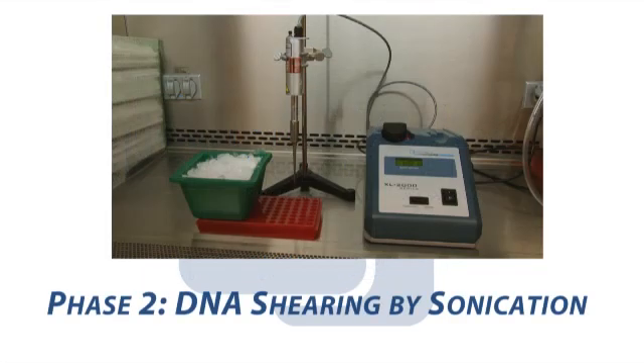In the second phase of ChIP, we will use a Sonicator equipped with a microtip to shear our DNA to fragment sizes of 100 to 1000 base pairs.